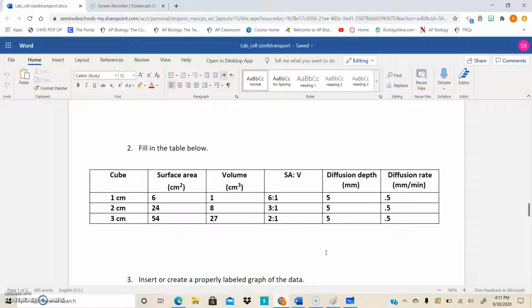And again, my issue is with these last two columns because if you were to graph them, you would not be able to get a conclusion based on a given graph. So I am proposing that we go differently or do one more step to actually find some kind of correlation between the cell size and the diffusion percentage that has occurred.